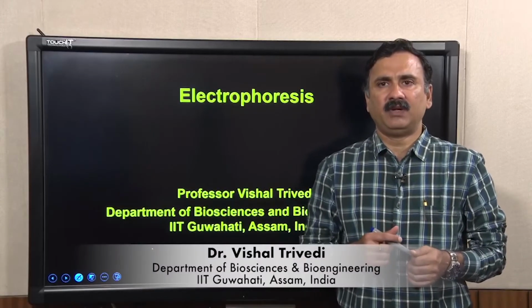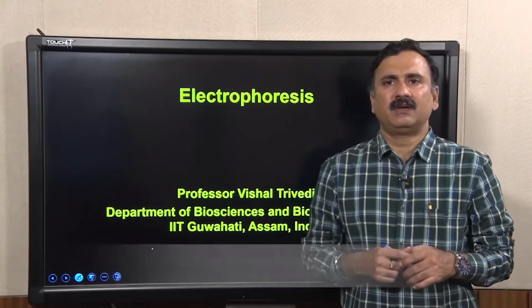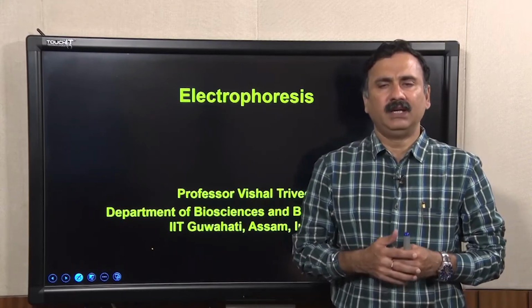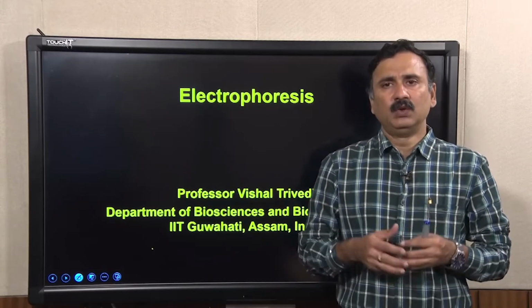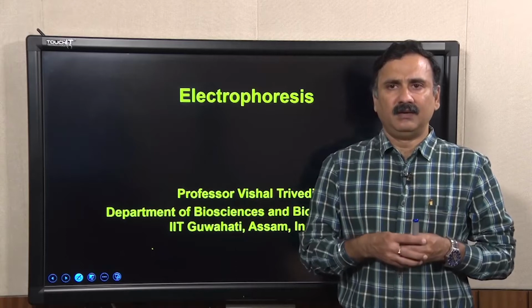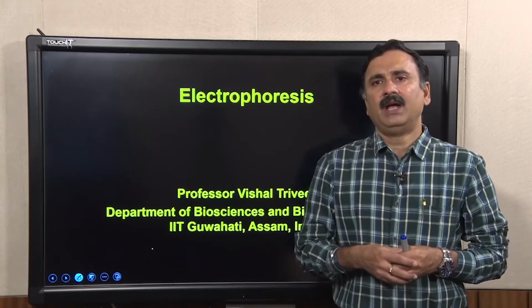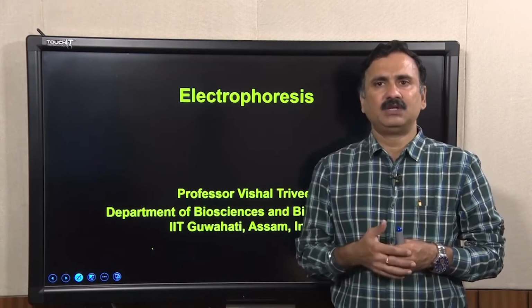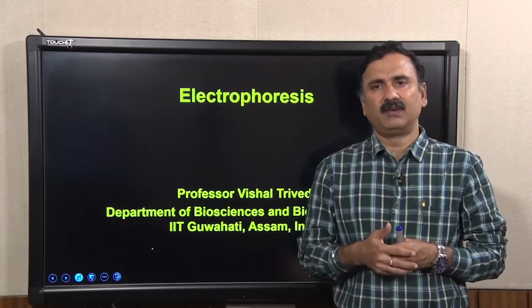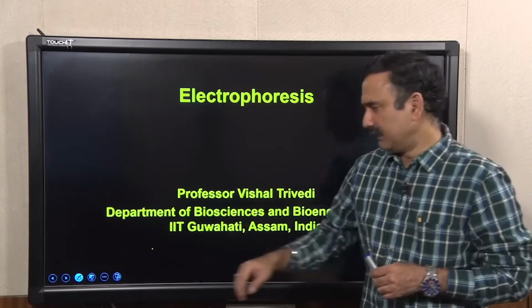I am Dr. Vishal Trivedi from the Department of Biosciences and Bioengineering, IIT Guwahati, and let's start our new topic, which is electrophoresis. Electrophoresis is a technique used to analyze biomolecules such as proteins or DNA and to separate them based on charge, molecular weight, or other biochemical properties. So, let us start discussing electrophoresis.